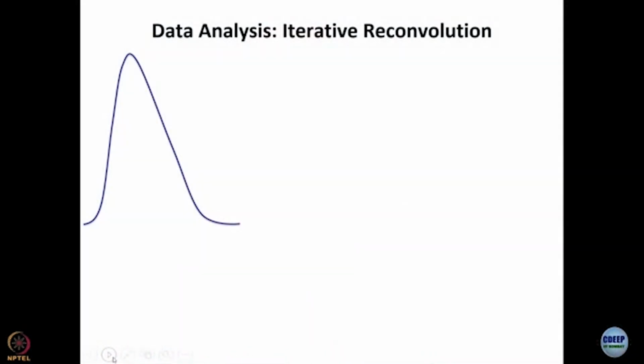Let us think of a laser pulse of a finite width. So, we can think that every point on this envelope is the tip of a delta pulse, right, and how many delta pulses would be there under this envelope? In principle infinite, in theory infinite, in practice the number will actually be finite, because as we discussed already, we work with some picosecond per channel resolution.